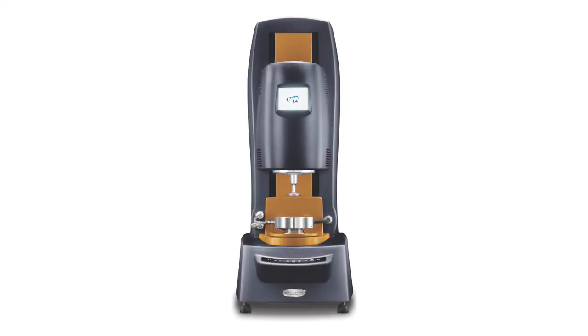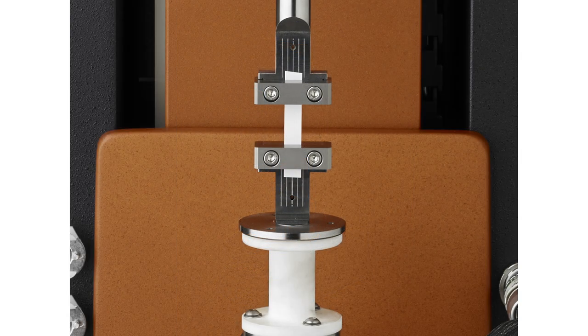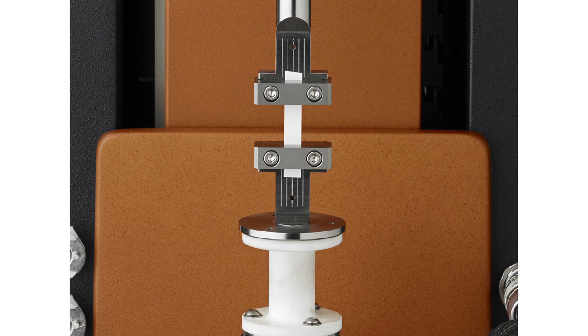Using the force rebalance transducer, the DHR is a rotational rheometer capable of performing linear dynamic mechanical analysis. The linear film tension clamp can be used to study viscoelastic properties of a solid film or fiber specimen in tension.